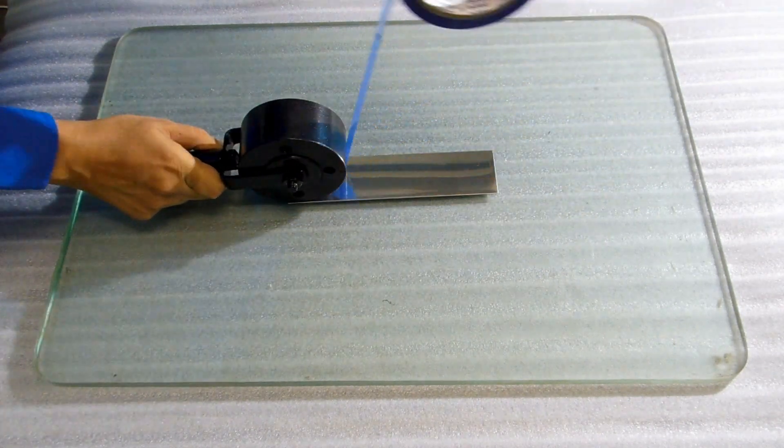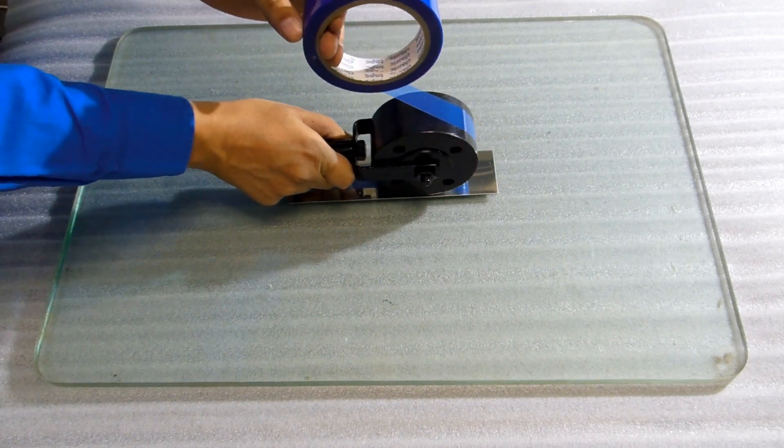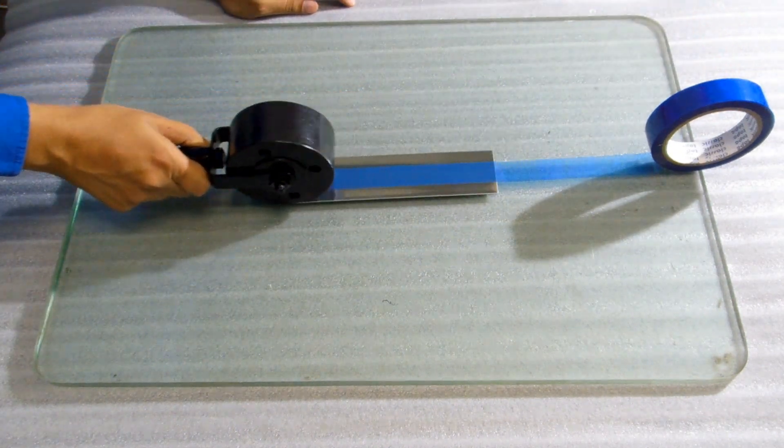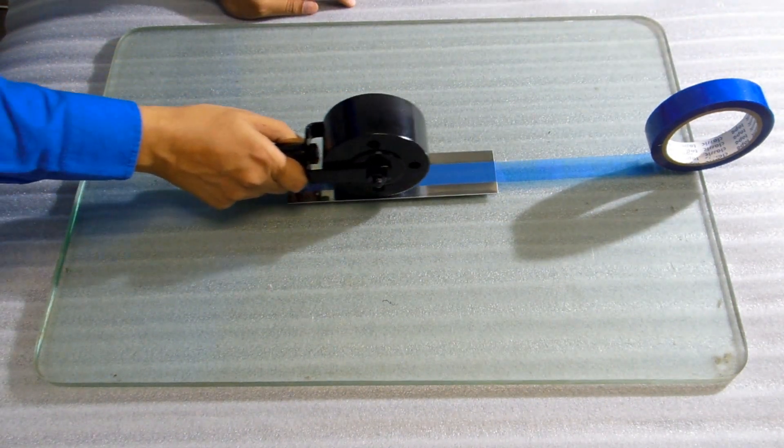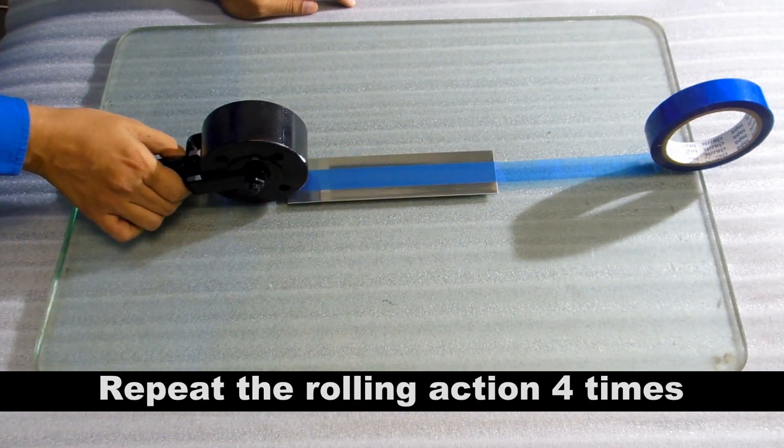Stick the sample to the test panel as shown in the video, use a 4.5 lb rubber roller to roll it 2 times forward and 2 times backward. Use the handle only to guide the roller. Do not apply any additional pressure with your hand.